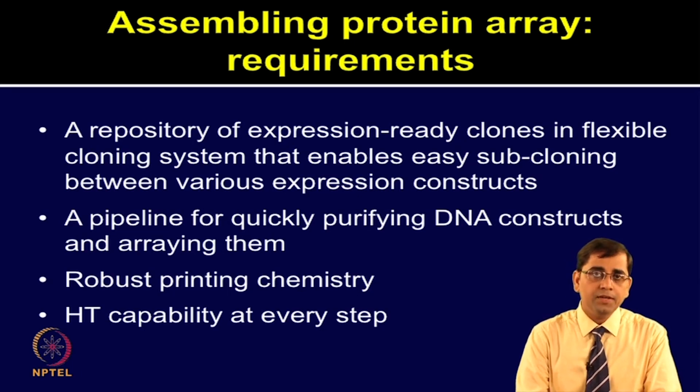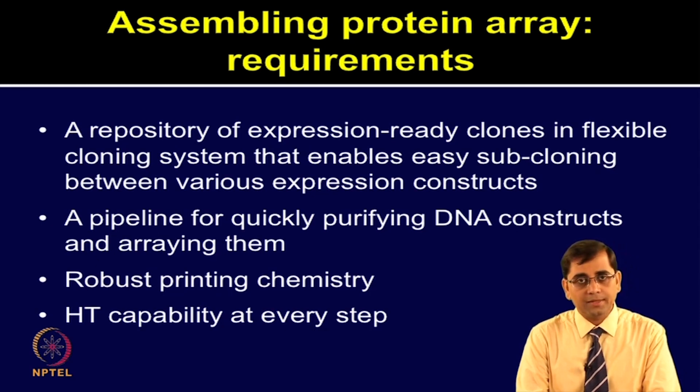In the previous lecture, we talked about recombinational cloning, which provides very high quality master clones. Now, those master clones can be easily transferred by subcloning them into a different type of expression system.